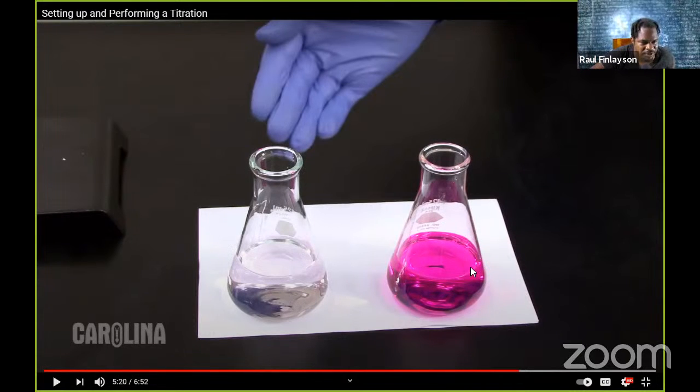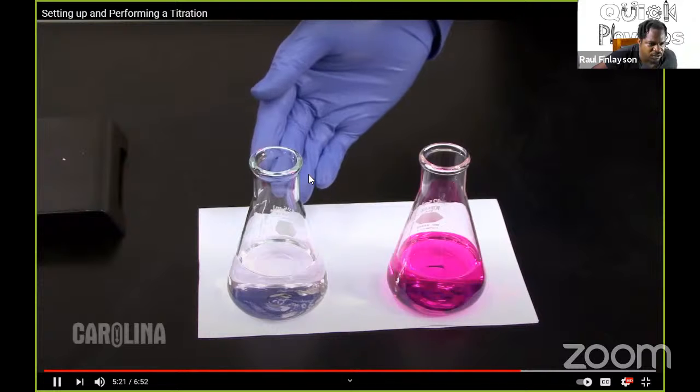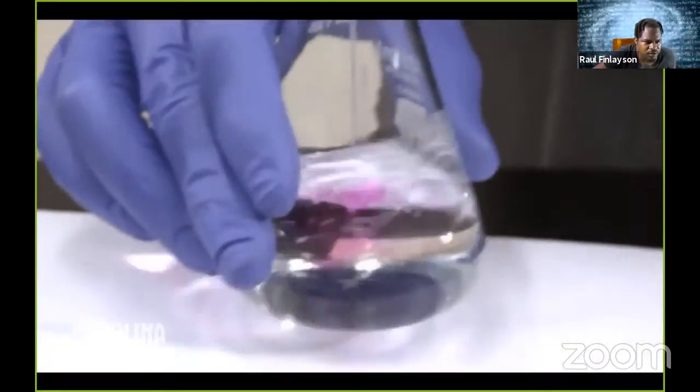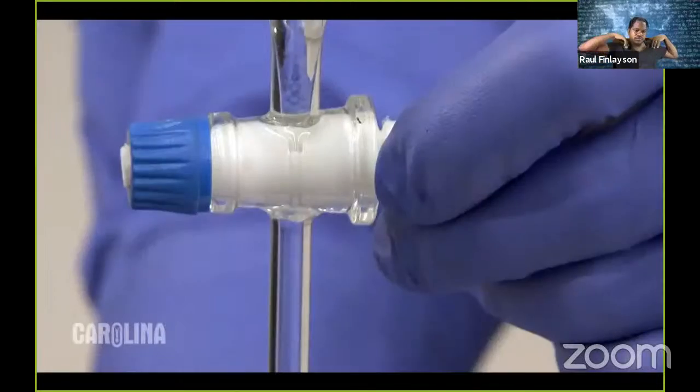It should be like a faint pink. This looks more like a darker pink, but you want more of a light pink. The desired endpoint is a pale, faintly colored analyte. To reduce the risk of passing the endpoint, slow down the addition of titrant when flashes of color begin to appear in the analyte.